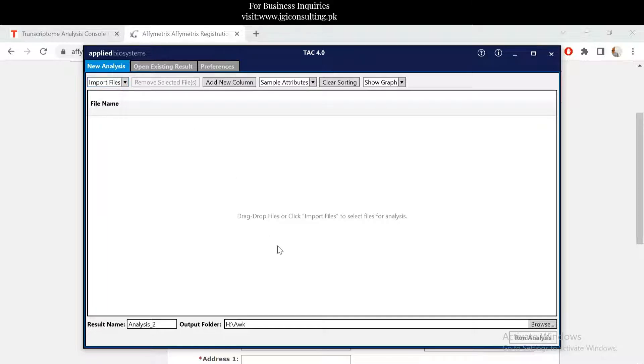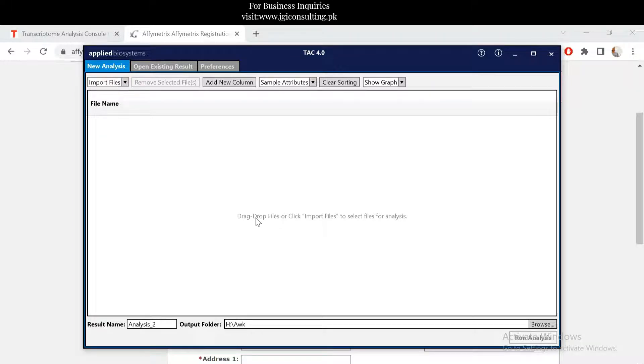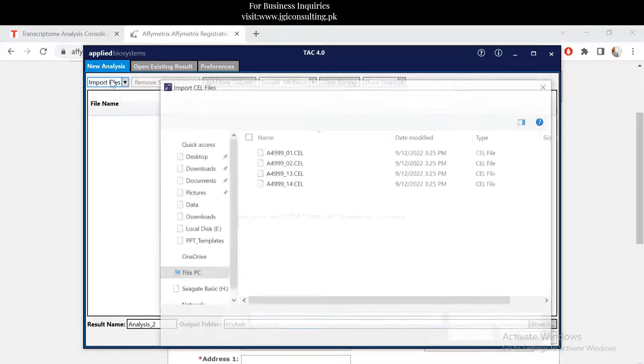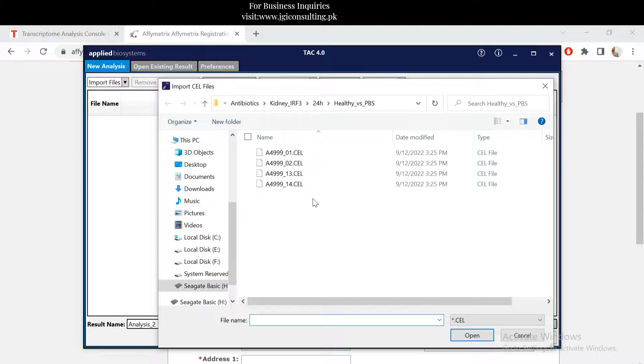That's how you have to install and set the synchronization of your email by logging into NetAffx. In the next part, I will explain how to import the files from here.